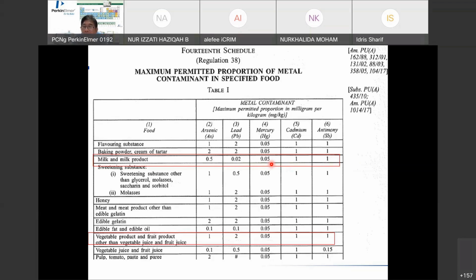So in this case, you need ICP-MS to do it. Unless you let go of the mercury element, you are doing 10 times dilution, also acid dilution, then for other elements, antimony, cadmium, this is 1 ppm, 10 times dilution, going down to 0.1 ppm, which is 100 ppb, ICP-OES can do it. But mercury is not included. If you want one single run for all elements, including mercury, you must use microwave, and the next instrument, because of the big sample dilution, ICP-MS comes into the picture. ICP-OES will not be good enough if you include mercury.